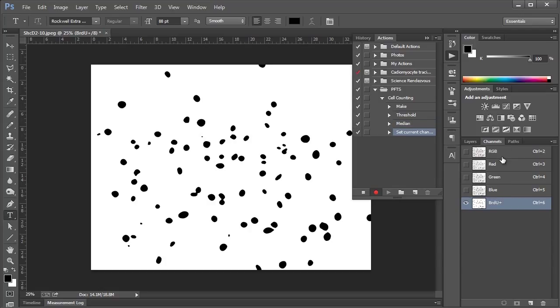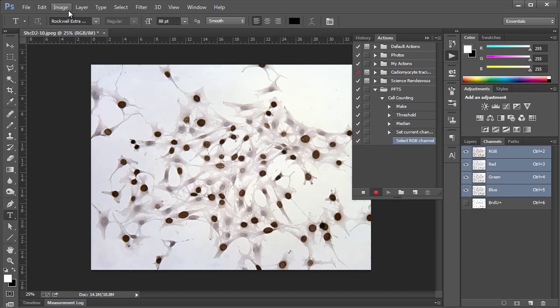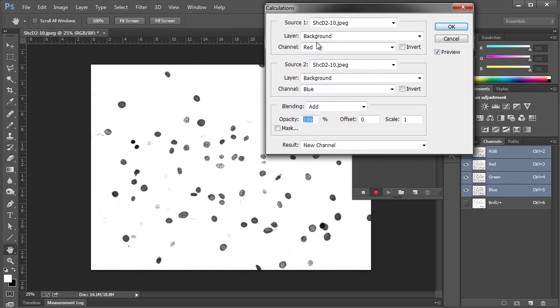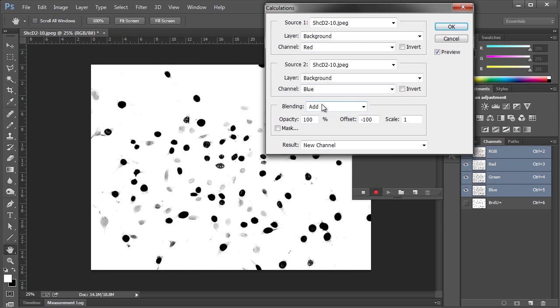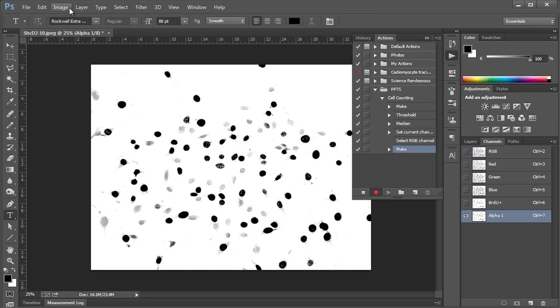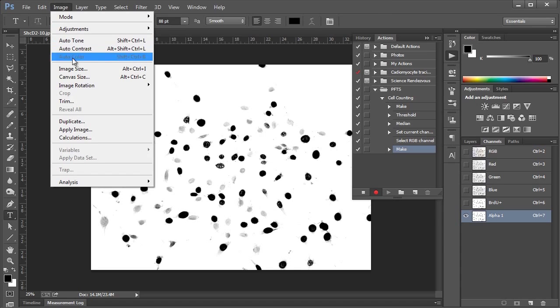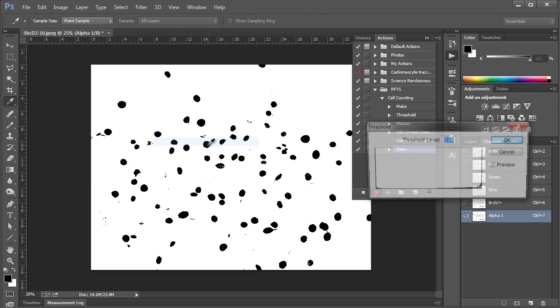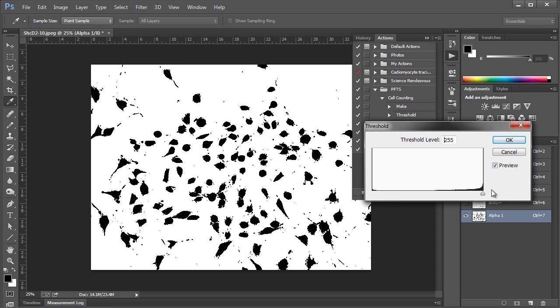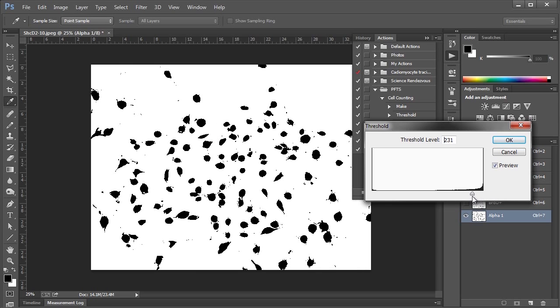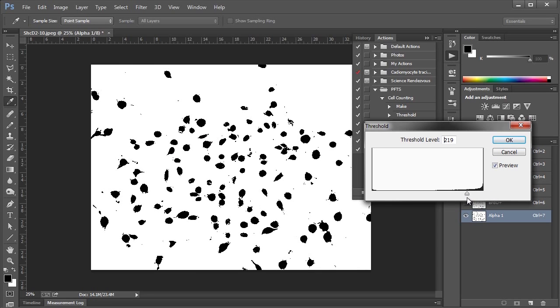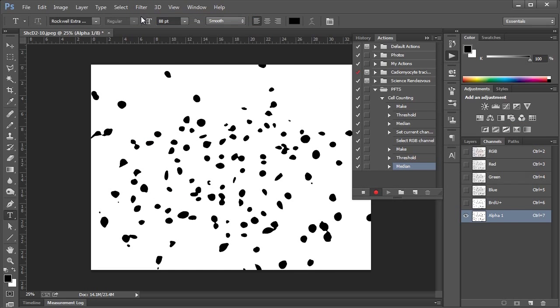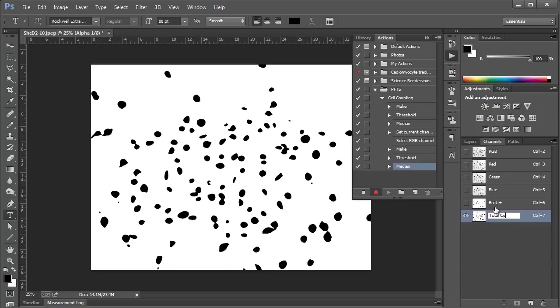And go to the Channels, and we'll name this new channel BRDU Positive to keep ourselves organized. I'll hit Enter, go back up here, again, do the same thing. Image, Calculations, Red, Blue, Offset, we'll go minus 100 for Total Cells, hit OK. Image, Adjustments, Threshold, same thing again, trying to pick up the cells and get rid of the junk. Let's go with that, hit OK, apply the same filters as last time, and let's rename this to Total Cells, hit Enter, and let's stop right there.